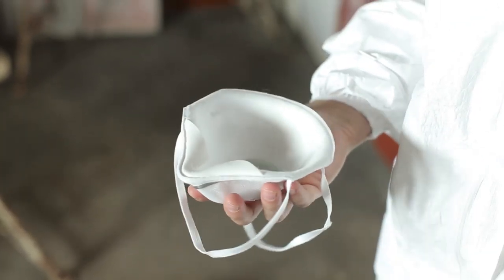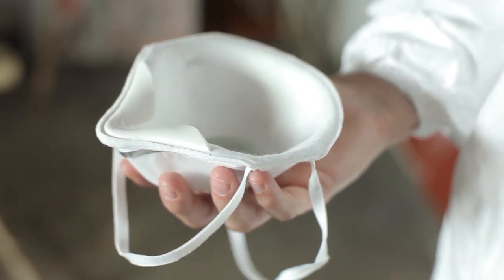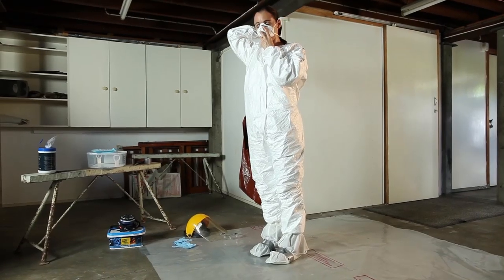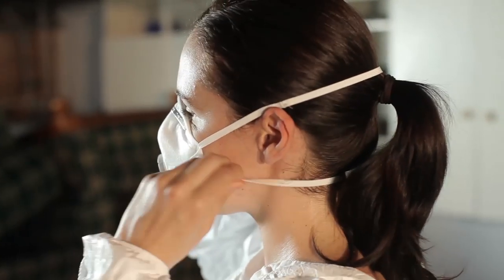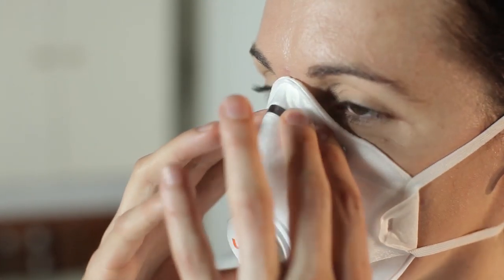When putting on a disposable respirator, hold it in your hand with the nose piece at your fingertips, allowing the head straps to hang freely below your hand. Position the respirator under your chin and over your nose, and hold it firmly in position. Pull the elastic straps over the top of your head. The bottom strap should be below your ears and the top strap high on the back of your head, above the ears. If you have long hair, ensure it isn't caught underneath the bottom strap. Using both hands, mould the plastic nose piece to the shape of your nose.